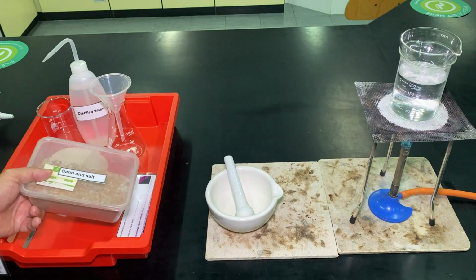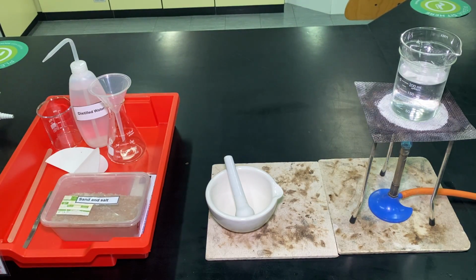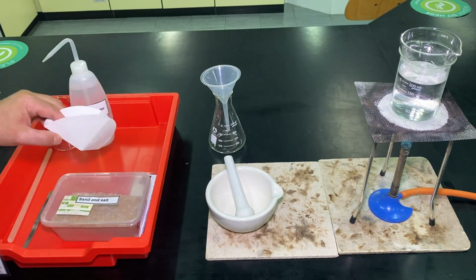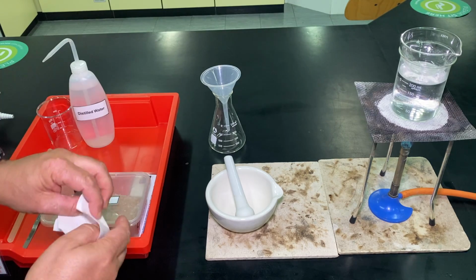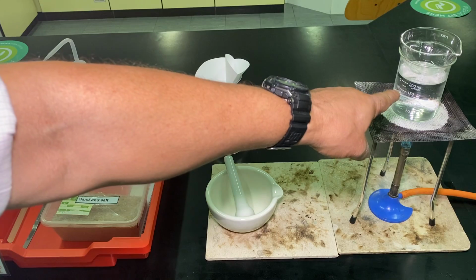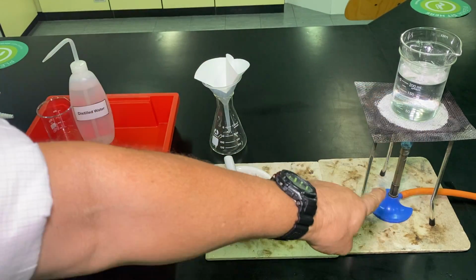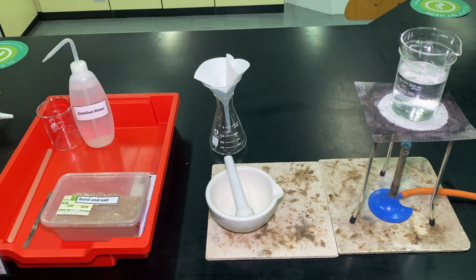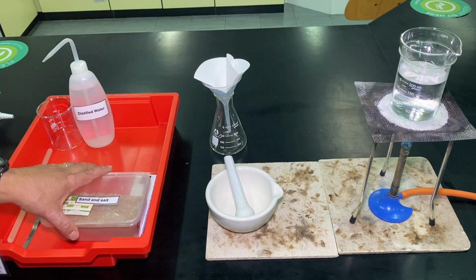Now, there's actually two main physical processes we're going to use today. One is filtration, and the other is evaporation. That's why we've got this beaker with water and a Bunsen burner heating away here. So I'm just going to get this up to boiling point. In the meantime, I can start the filtration process.